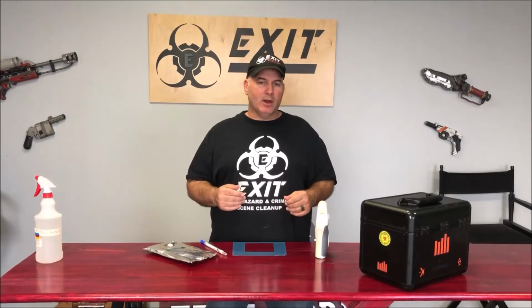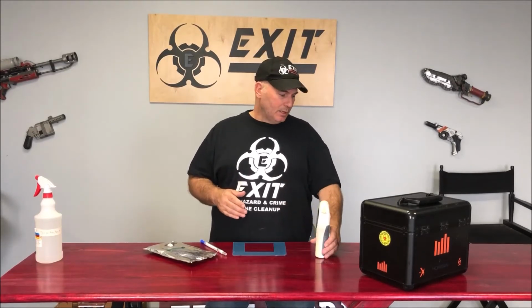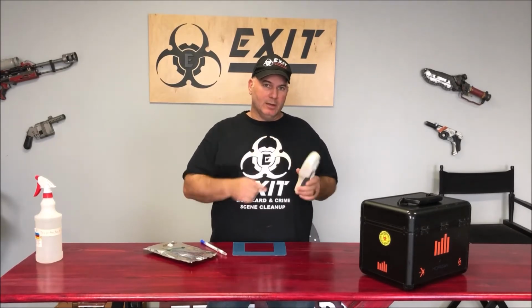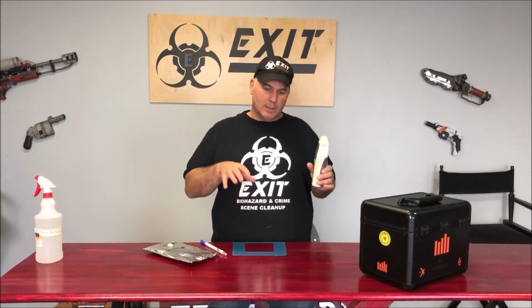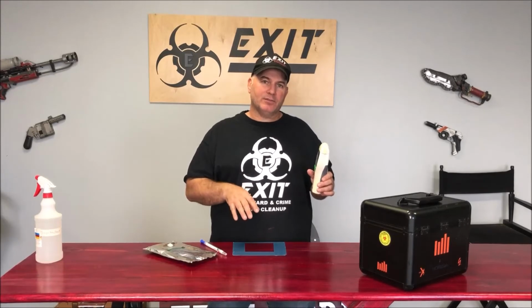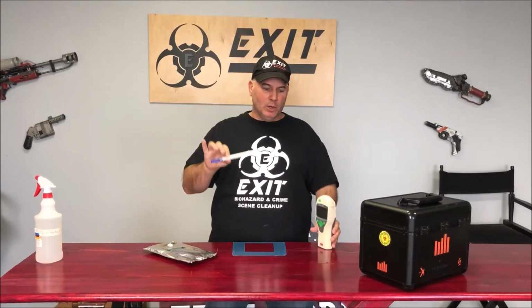If you're in a meat packing plant and they are looking for a cleanliness factor of RLUs, which is relative light units, generated by this machine, in other words, this is going to tell me what the RLU number is for a specific area that I test. We take this, we open this up.